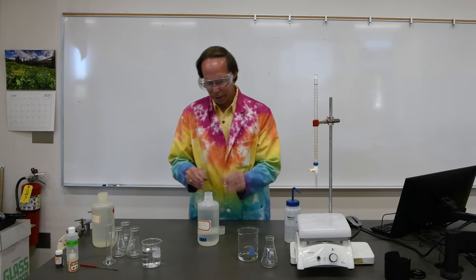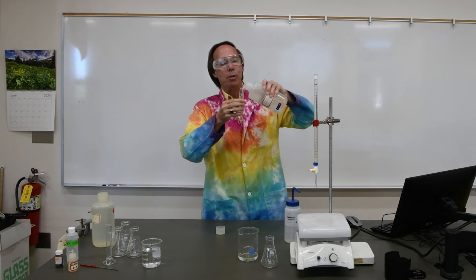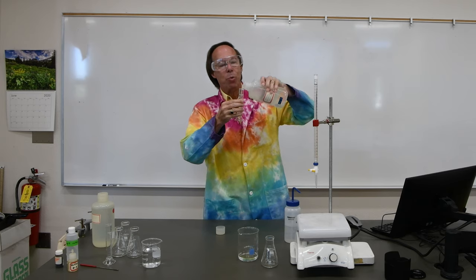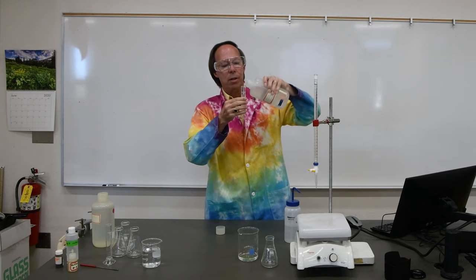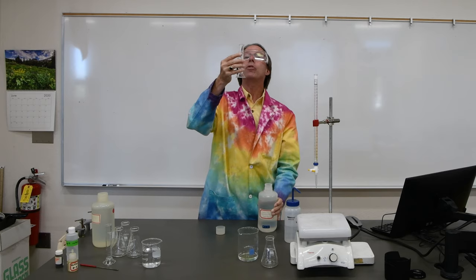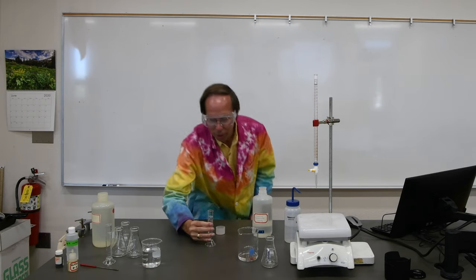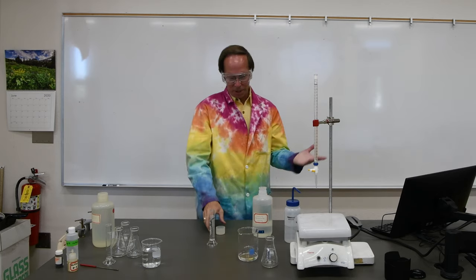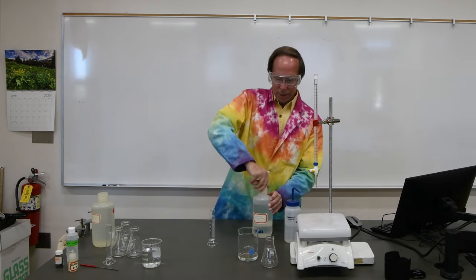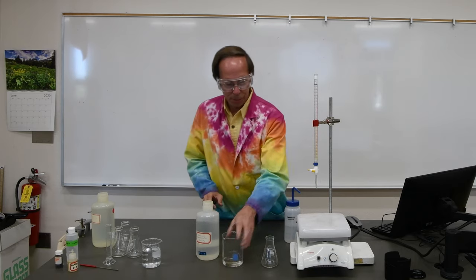Now we can go ahead and measure out approximately 25 milliliters. It doesn't have to be exactly 25. We'll just simply need to get a reading of that. And it looks like I have got that right on the nose. I managed to get it right on. It is just exactly on 25 milliliters, so that's good. Now we want to transfer that sample to the flask.